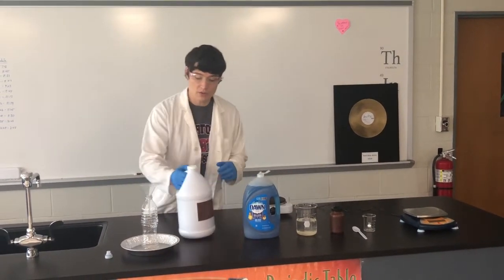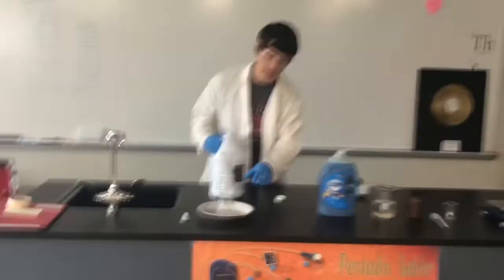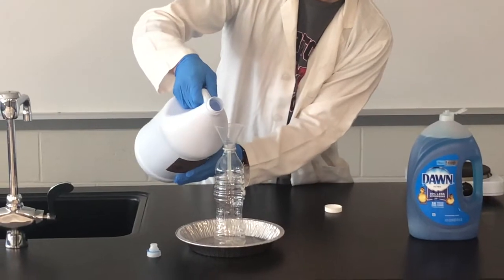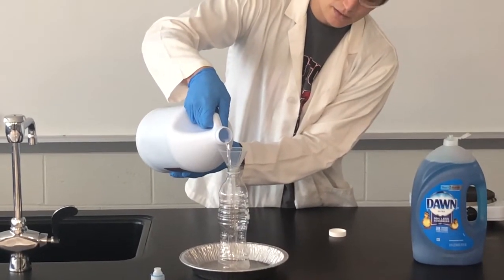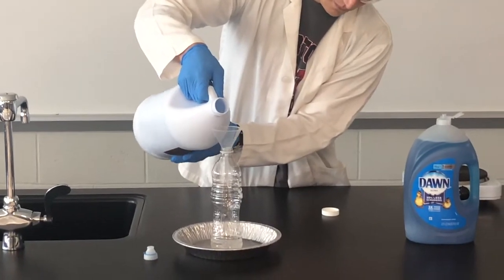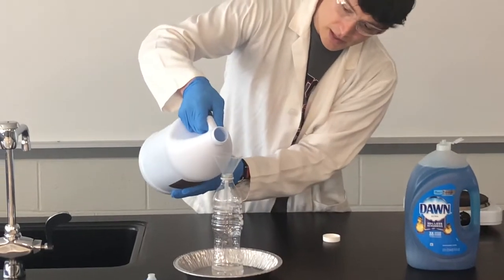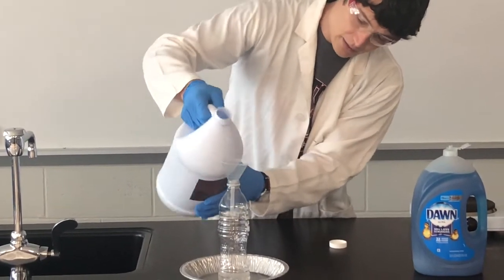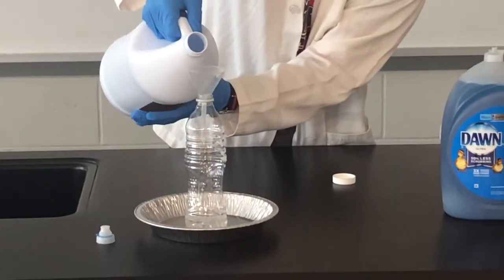I'm going to start with my H2O2. I'm going to take 80 milliliters. As I have my bottle marked here, I'm going to use a funnel. I'm going to pour very slowly because this is my dangerous chemical I'm using today. I have exactly 80 milliliters marked on this bottle, and I want to be precise in my measurements to get the appropriate reaction.